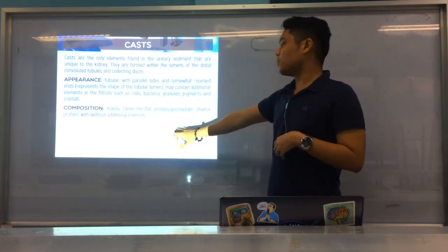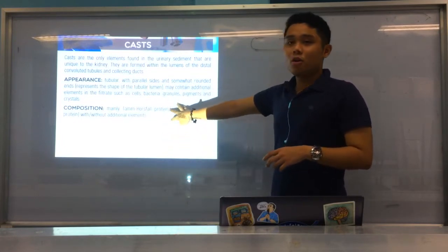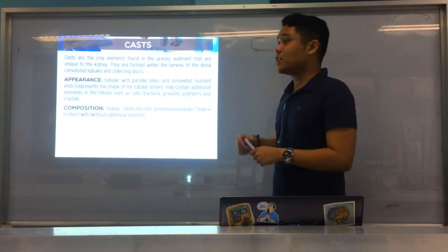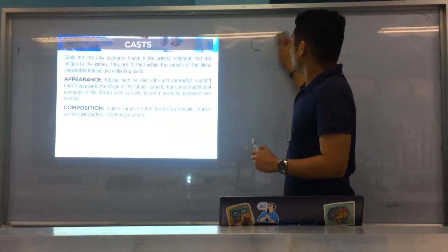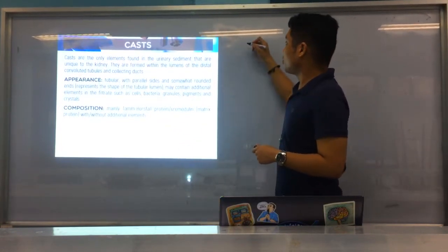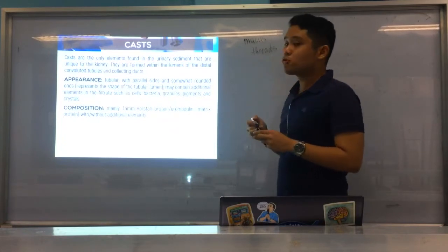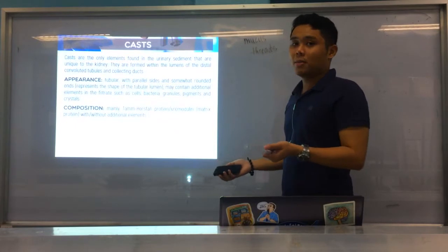Its composition is mainly Tamm-Horsfall protein, okay? Please take note, Tamm-Horsfall protein or uromodulin. Its old name is Tamm-Horsfall protein; now, it's called uromodulin. Now, uromodulin is a normal protein released by your RTEs, okay? Renal tubular epithelial cells. Uromodulin is also found in mucous threads, okay? This is in the later part. That's also a constituent of your mucous threads, okay? It's a normal protein, again, released by your renal tubular epithelial cells.